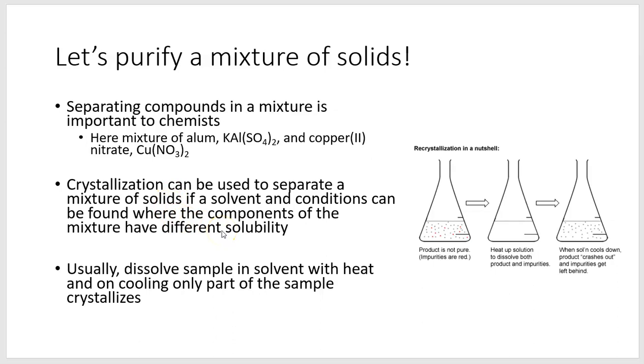So crystallization as a means of separations of mixtures is really an important part of what chemists do. I had a friend who said, there's one section of chemistry called analytical chemistry, and analytical chemists pretty much all they do is, one is analyze, figure out what's in a sample. That's sort of what the name implies. But the other one you might not think so much about is they separate, and they're really interested in ways that you can take mixtures of things and separate them.